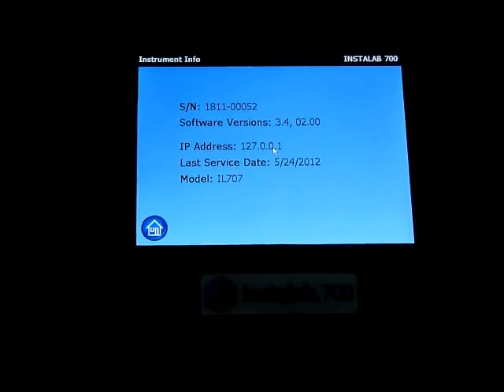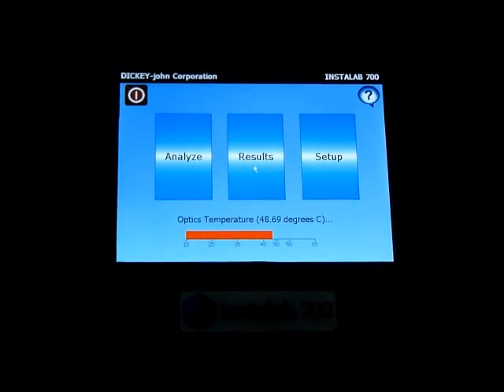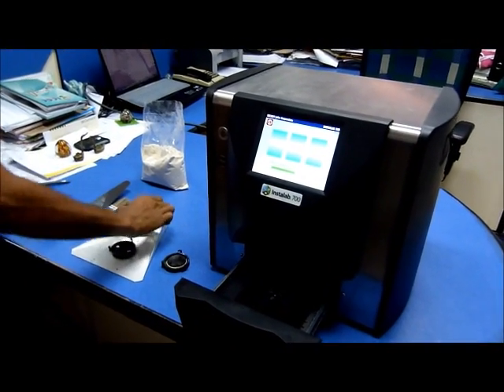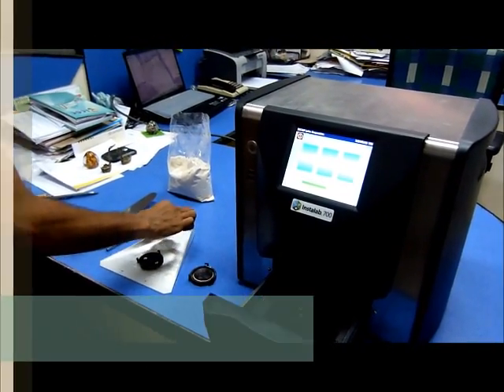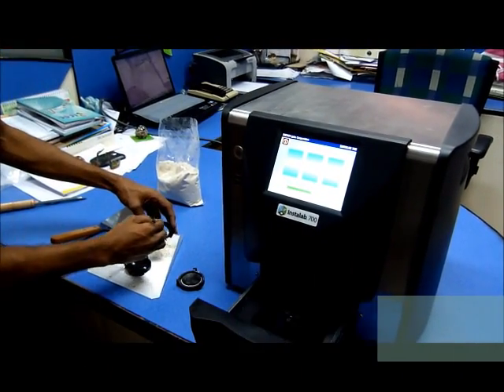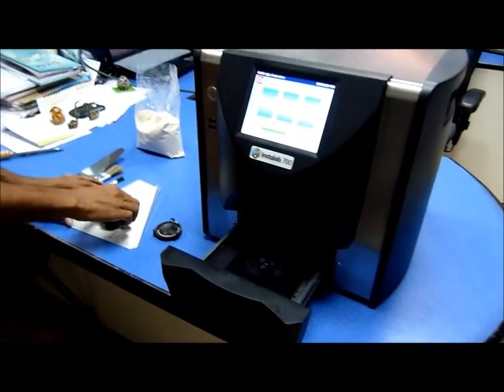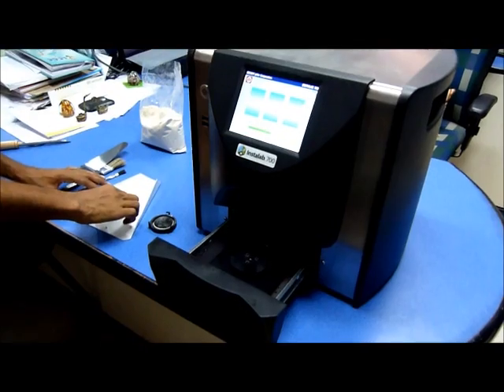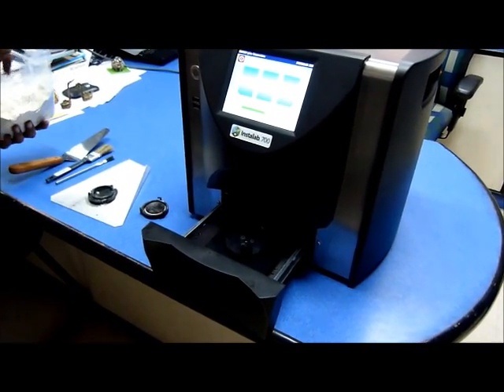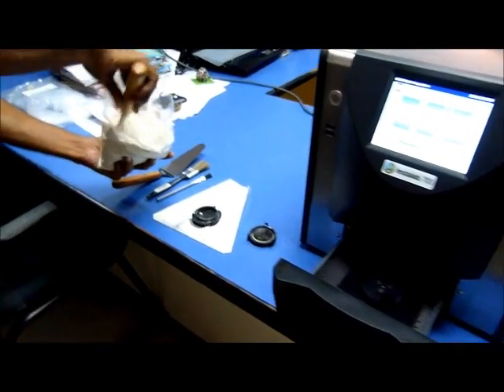We make a quick presentation on the sample analysis technique. The system is supplied with standard sample cups, two numbers. It also has a provision of using an open sample cup for semi-solid samples. The two latest products added are the open sample cup and liquid sample cup.